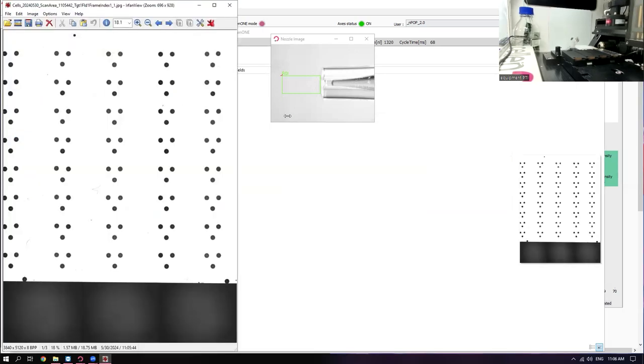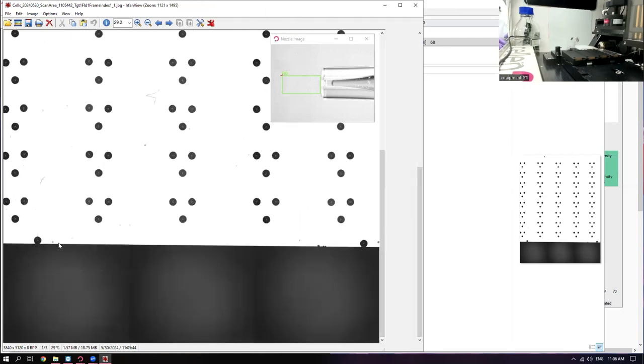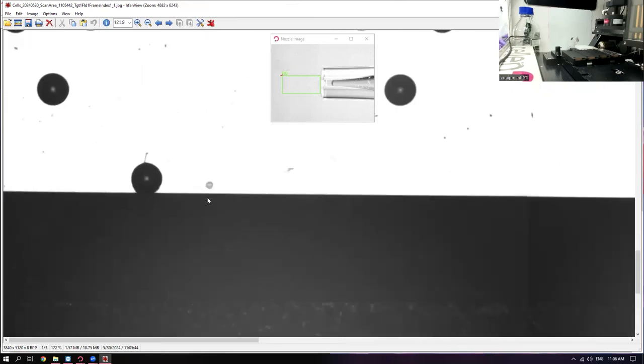All right, so these are our after drops. One thing that we've incorporated recently are these fingerprint drops, which are essentially every single one of these positions gets every reagent, except for its label. It only gets one of the labels, right? And so it's easy to see when you add the trypsin, for instance, you see the droplet get bigger. But what we've done is we've spread out all of the reagents here at the bottom of the slide. So here's the DMSO droplets. Here's the cell droplets. We'll get a trypsin droplet next. If you have multiple cells, you'll see multiple cell droplets.